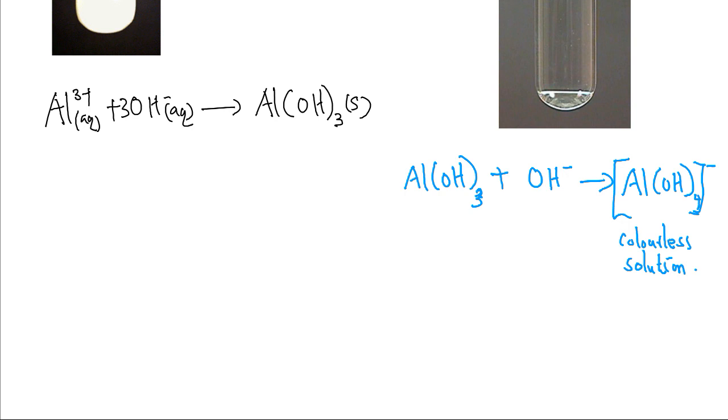Finally, the last one, number 8, we have lead II ion under dropwise and excess.